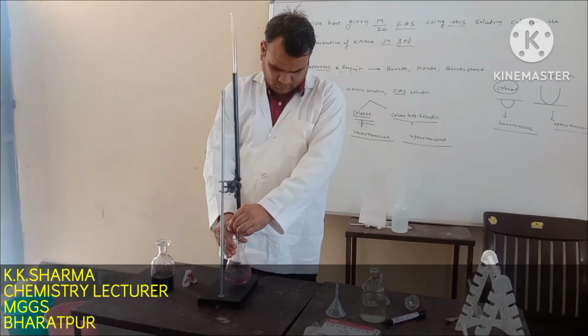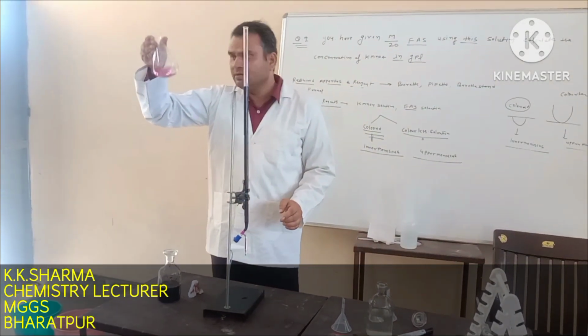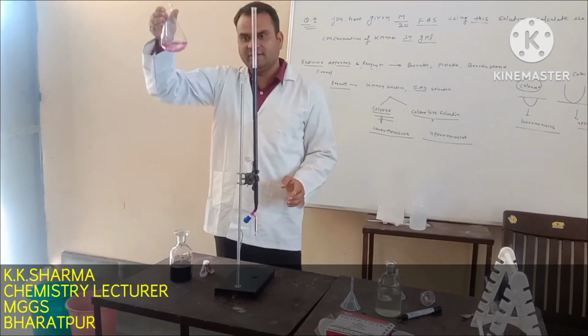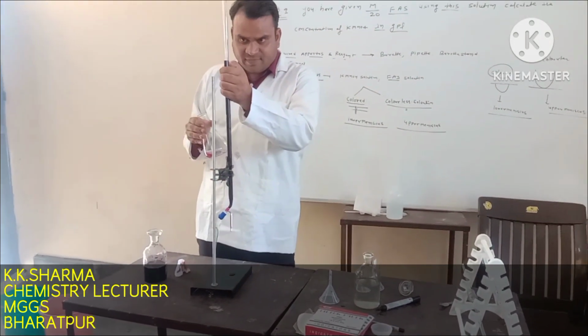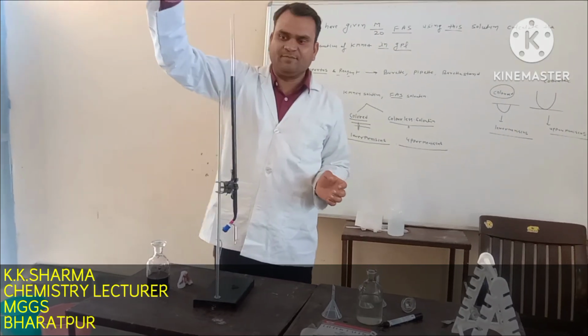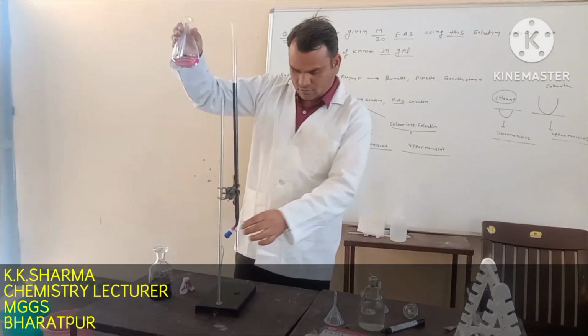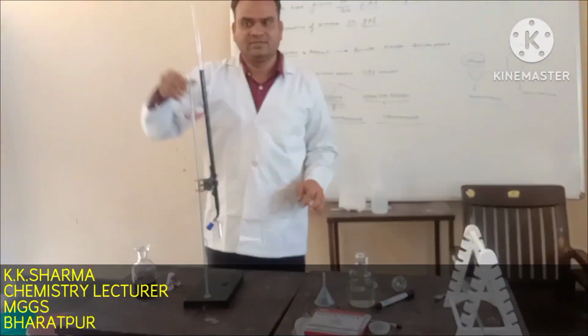Okay, 1 or 2 drops more in amount. Okay, the reading is 10.5. This is the slightly pink color. Okay, slightly pink color.